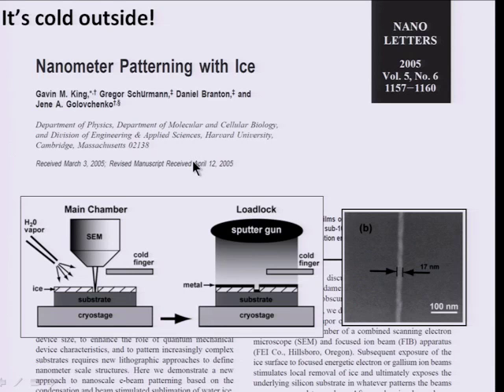So another thing, in this sort of whirlwind review of these characterization techniques, I want to emphasize is that there is some overlap between techniques for characterization at the nanoscale and techniques for fabrication at the nanoscale. So as we move on through the lectures, we'll bring in some examples from fine beam lithography. For example, using beams of electrons or beams of X-rays instead of beams of light to play with materials and to fabricate them. And in the same vein as electrons have a finer wavelength and enable finer resolution than light, electron beam lithography can be a higher resolution technique than optical lithography. And I just think this paper is a pretty cool and appropriate example.